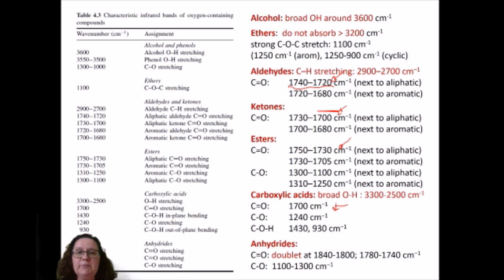It can only be between these two wave numbers, otherwise it's not the carbonyl of an aldehyde group. This is not the way to use the tables. Keep an open mind and keep flexible. That is around 1700, around 1800, in your identifications.